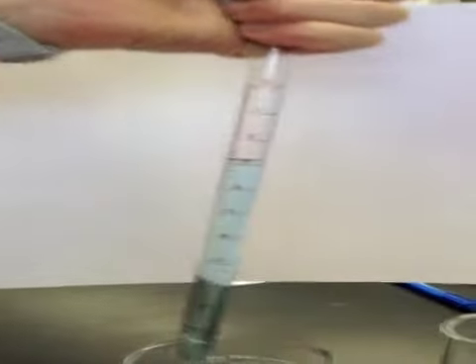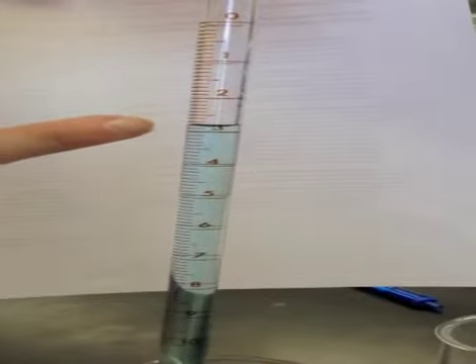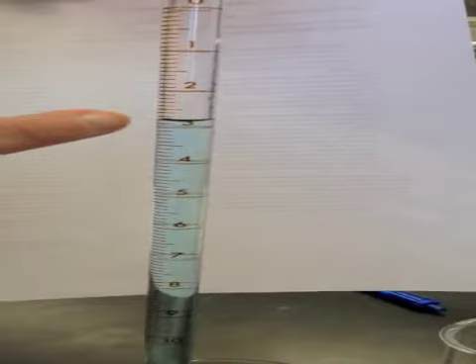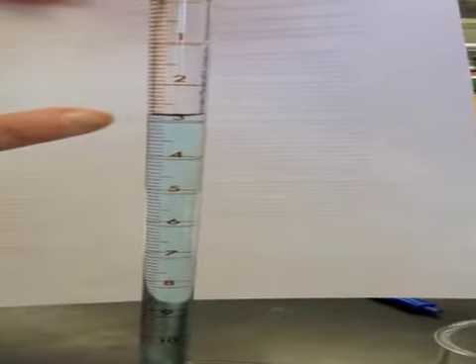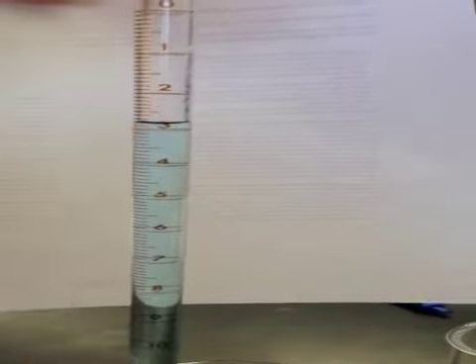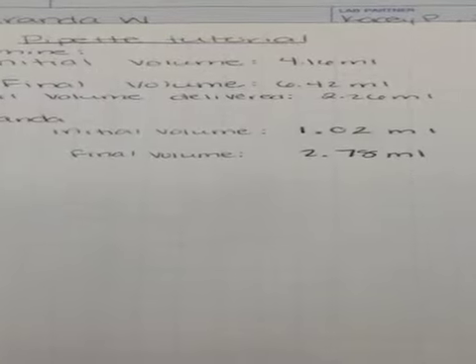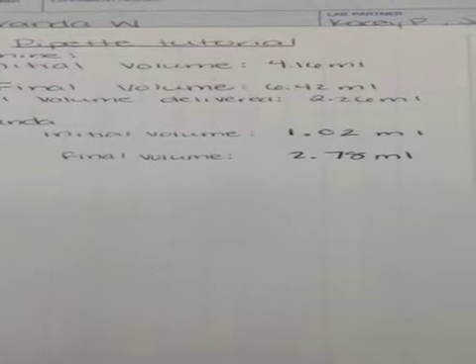And take the final volume which will be 2.78, read from the bottom of the meniscus once again. The final volume is 2.78 milliliters.